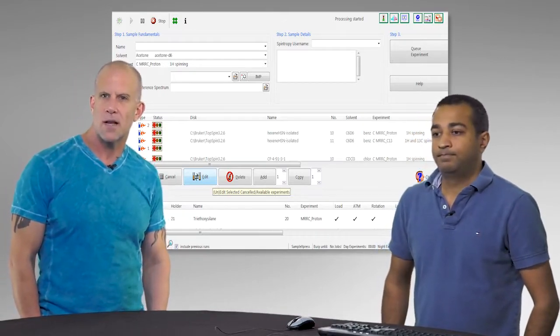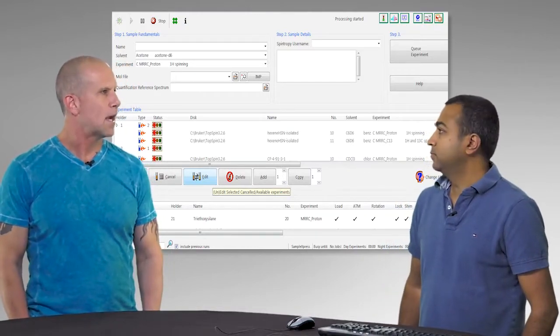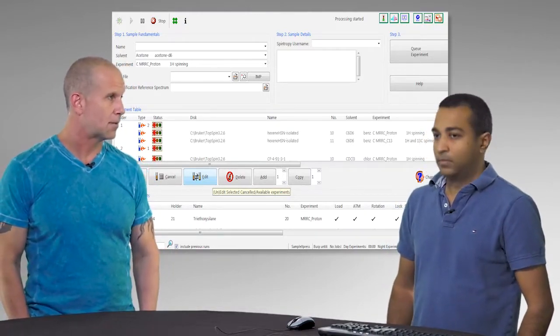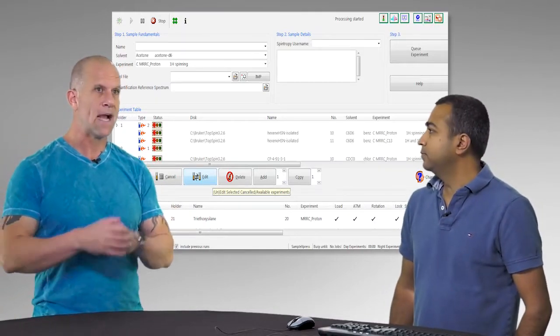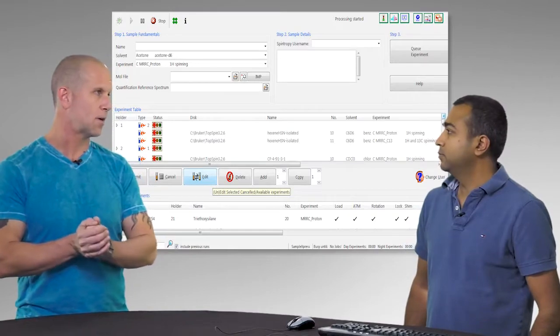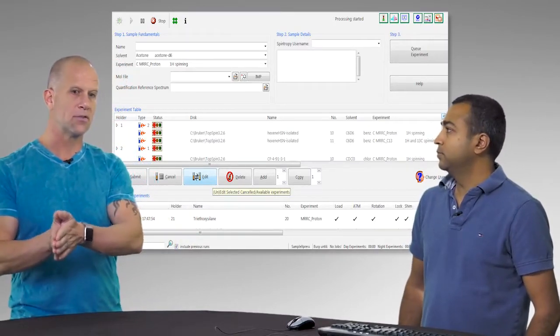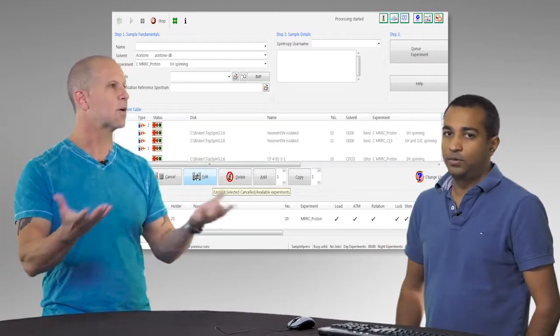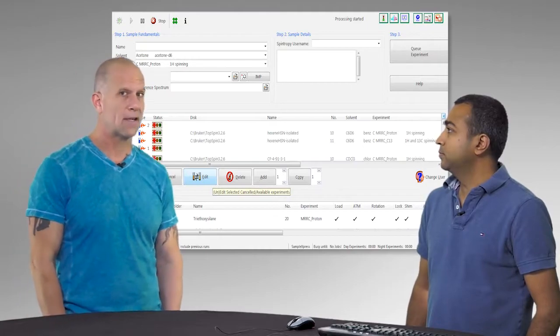So, Samrat, today we're looking at, in the Magnetic Resonance Center, we have several automated NMRs. We affectionately just call them walk-up NMRs, right? Right now we have a 400 megahertz walk-up system. It's by Bruker, and a 600 that's used less frequently in walk-up mode. And soon we're about to have a 500 megahertz system, probably start of 2019.